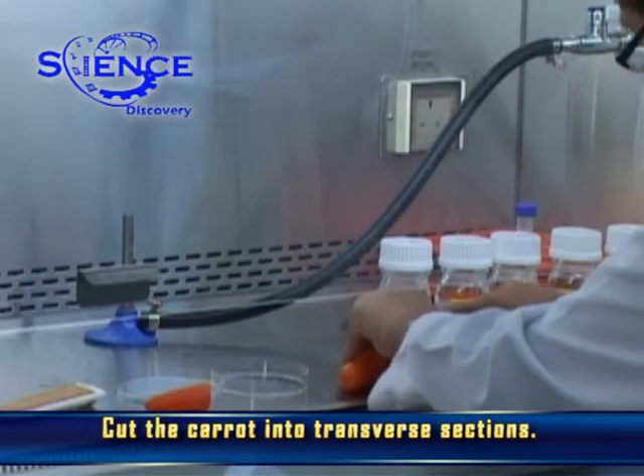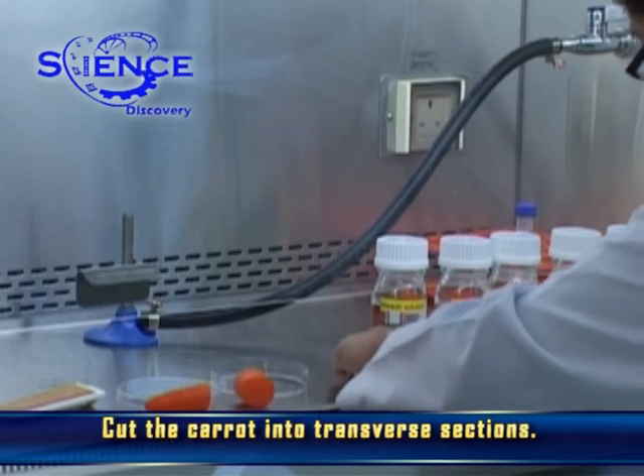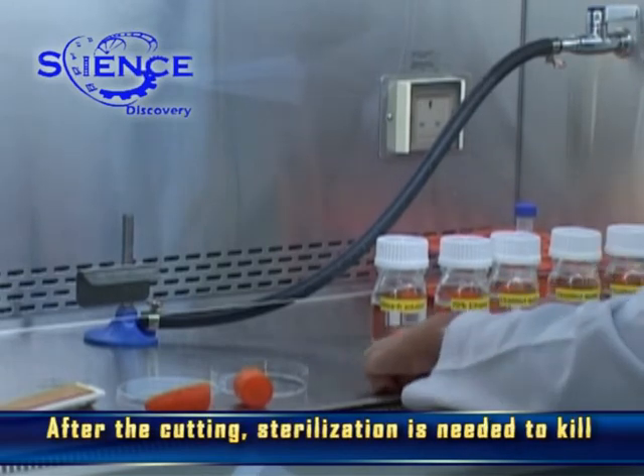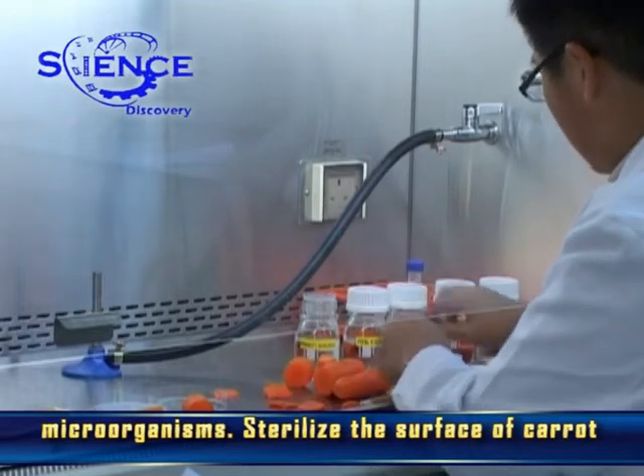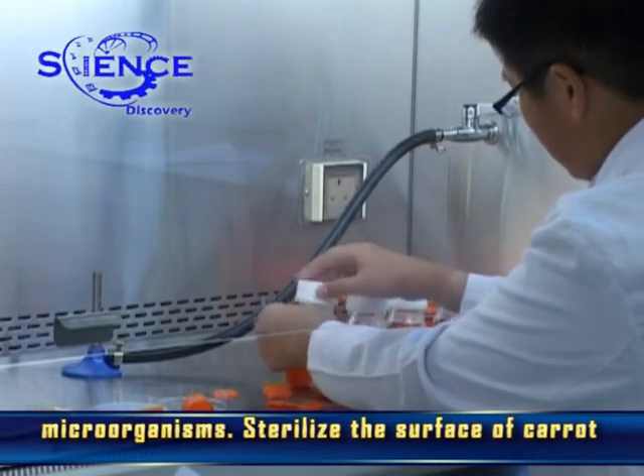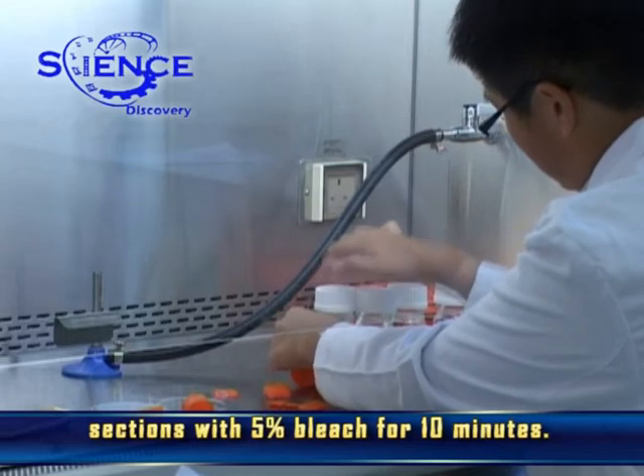Cut the carrot into transverse sections. After the cutting, sterilization is needed to kill microorganisms. Sterilize the surface of carrot sections with 5% bleach for 10 minutes.